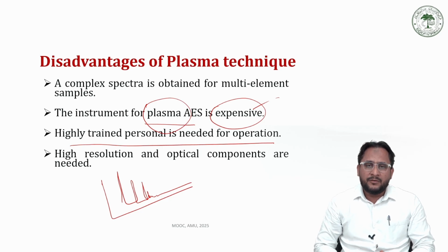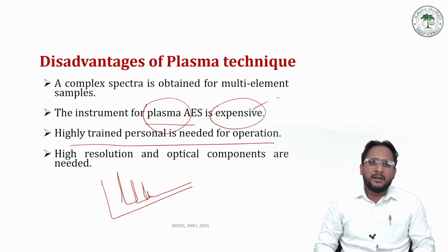With this, we have covered the different components of AES. Now in the next lecture, we'll talk about these three plasma techniques, how we can create a plasma by using microwave or direct current, and then we'll discuss inductively coupled plasma in the next lecture.